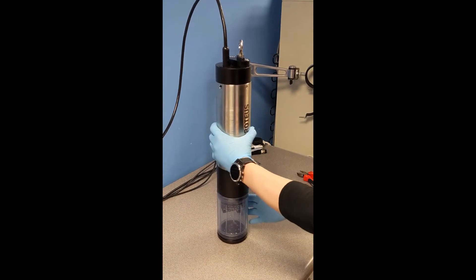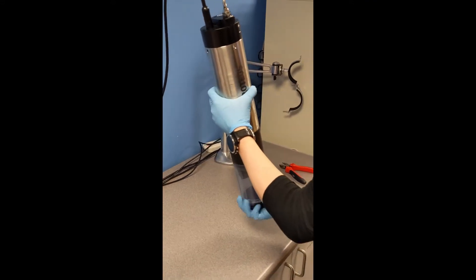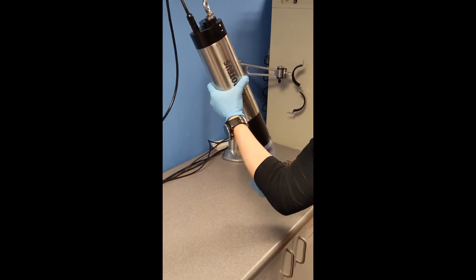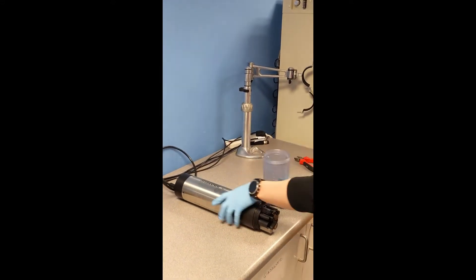So we're going to fill the calibration cup up with the calibration fluid. Just unscrew it, press the Proteus on its side.